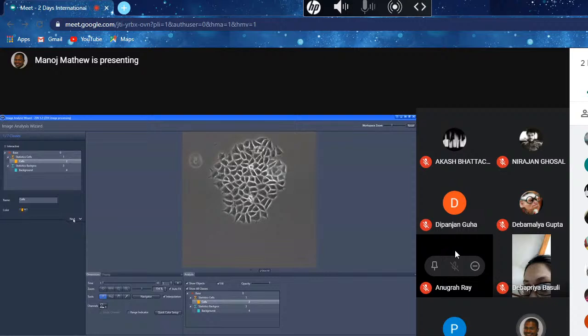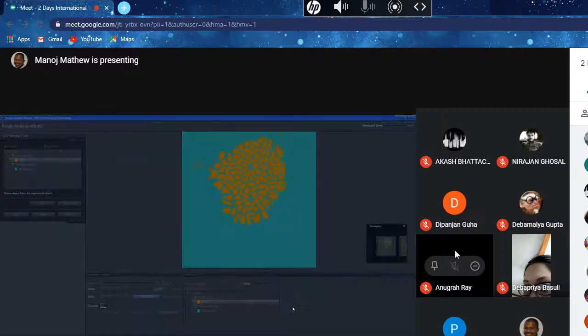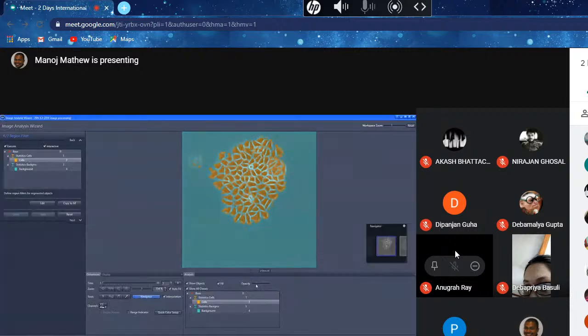I don't want to select a region of interest. And in this step, you see many of the blocks are missing, and they're missing because my segmentation is not done using Otsu. Segmentation is done using that model that I created. Of course, it has the post-processing steps like morphology and watersheds, but here I am preferring not to use them. In the next step, I can change the opacity to make it look a little bit easier for you.